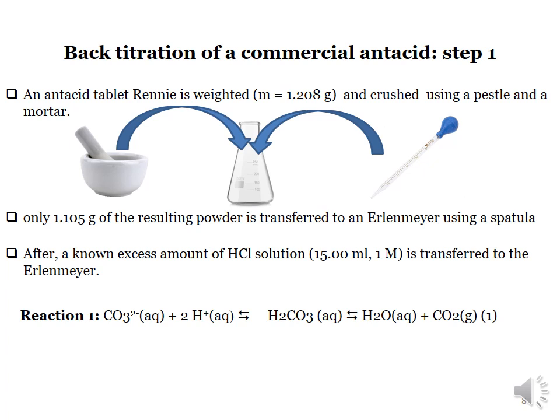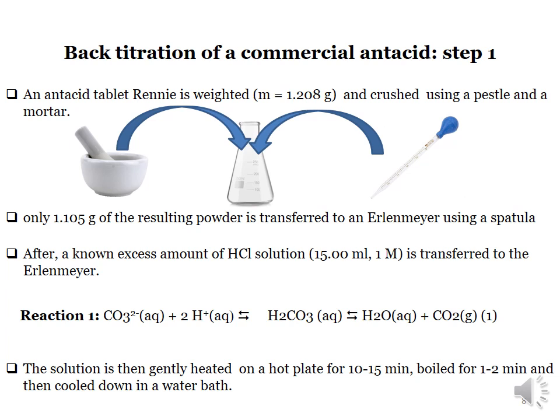But this is a reversible reaction under equilibrium, and in order to make it irreversible, the solution is then gently heated on a hot plate for 10 to 15 minutes, boiled for 1 to 2 minutes, and then cooled down in a water bath, because we need to titrate it.